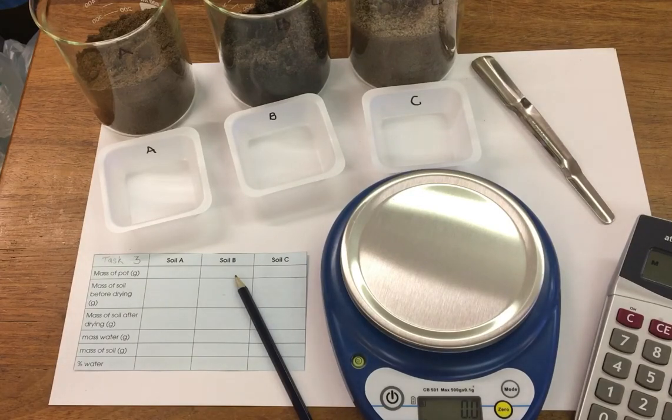In this experiment we're investigating the water content of our three soil samples. In task three we're going to measure out our soil samples and pop them overnight in an oven to heat up, and then we're going to find out the water content of the soil.